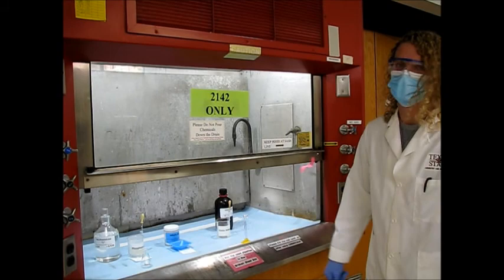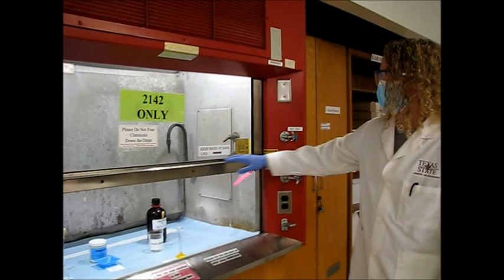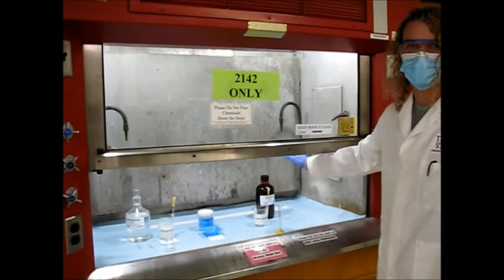So according to the procedure, we need to measure out these chemicals and add them together in the fume hood to prevent any toxic or corrosive fumes. So just a side note, we want to make sure that the hood is below the sash right here, just to make sure that it's actually venting properly.